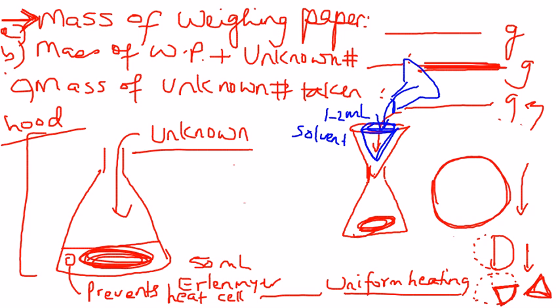You will see as the liquid sees the cold filter paper, it will tend to crash out. That is going to happen. So you will lose probably a little bit of your recovery there. And if time permits, you can go for a second crop. If not, then we'll just live with it. So you will see that your liquid will go down and it will immediately tend to crash. If it does not, then we are just going to cool it in ice, for at least 10 minutes.